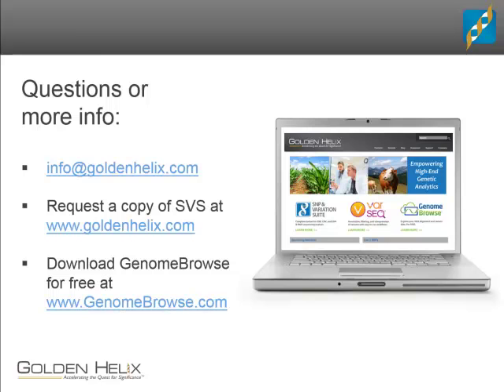Another question, does SVS contain whole genome sequence pipelines so I can include FASTQ files and get out VCF? Unfortunately, no, we don't do alignment or variant calling right now.